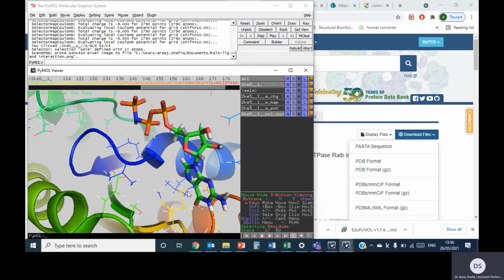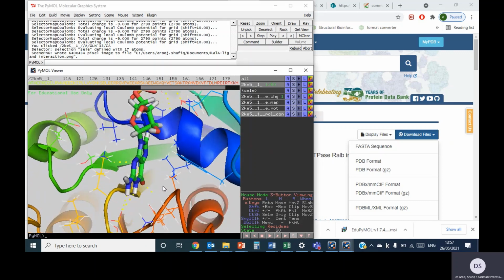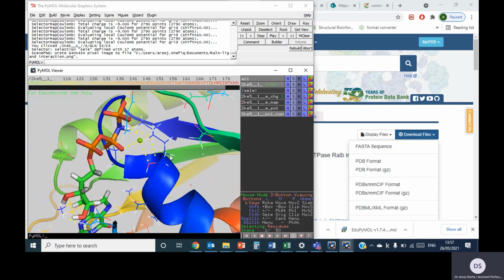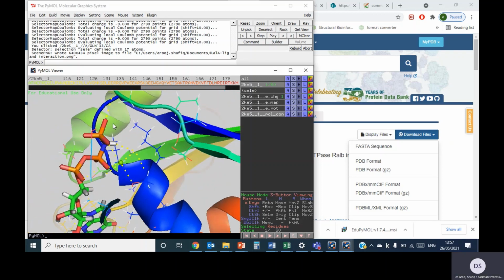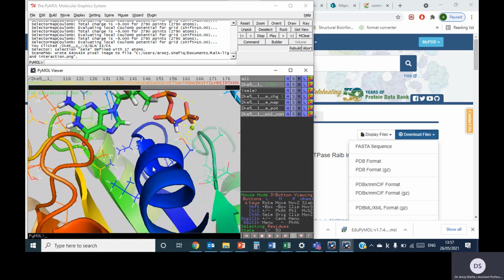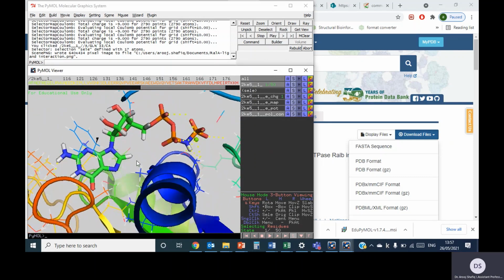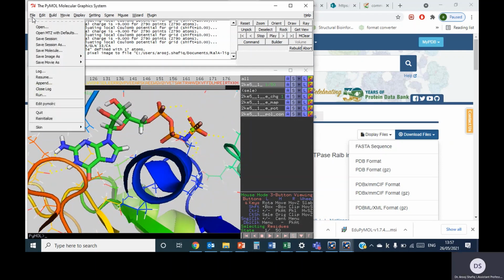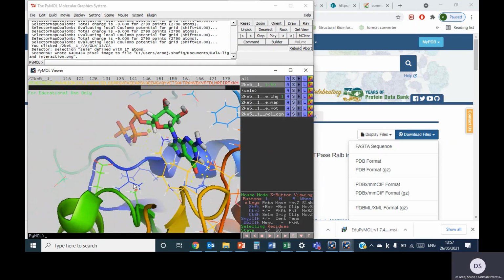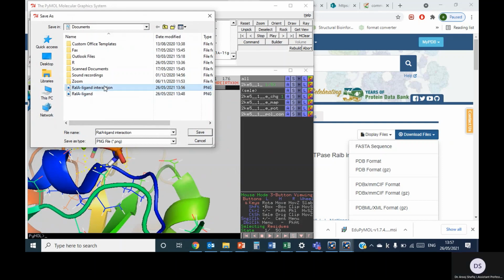These small yellow dots represent the interactions of the ligand with the amino acids. And here it is showing the interactions of the magnesium ion and the amino acids with these yellow dotted lines. By doing this, you can visualize the interactions of the protein molecule and the ligand in a detailed manner. I can also store this as an image if you want. So you can store the various images you require using file and PNG format action.